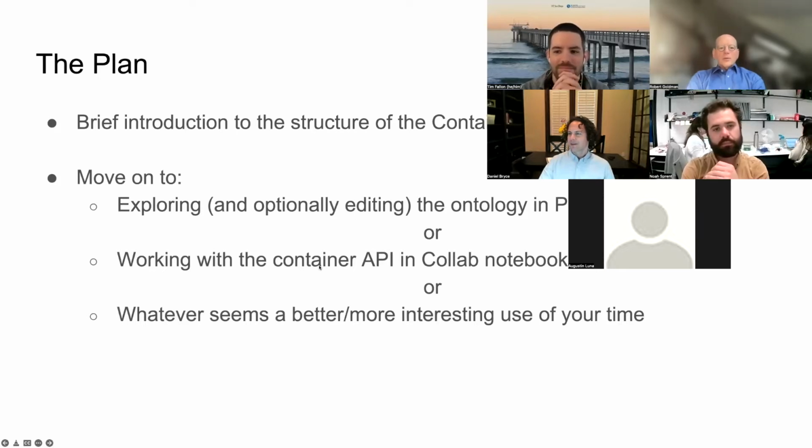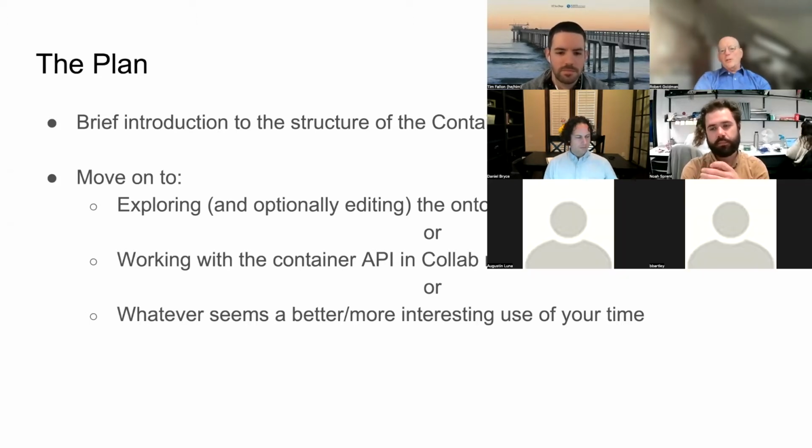All right. So this is the plan. It's a big breakout session, so we can just play it by ear. But I thought probably the best thing would be for me to give an introduction to the structure of the container ontology, and maybe the container server. So I'll do a pretty short presentation here.